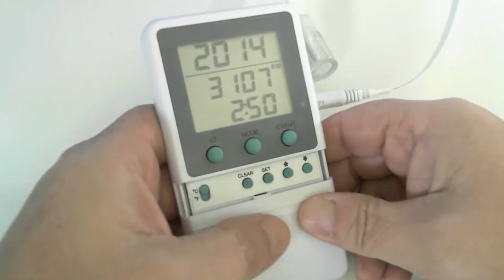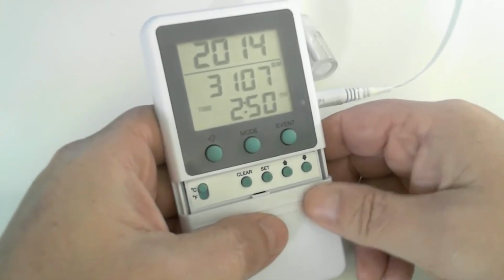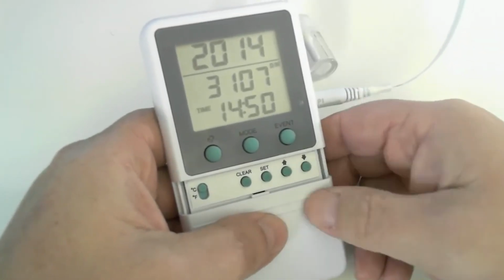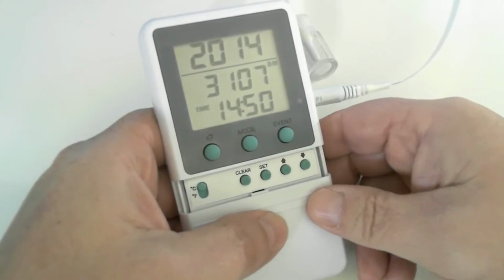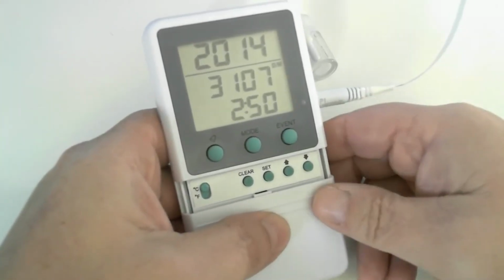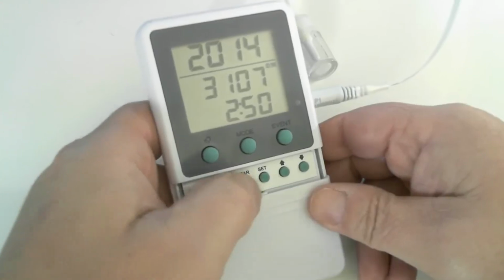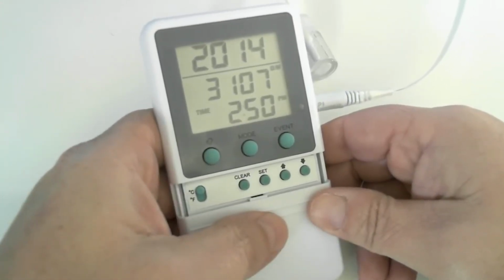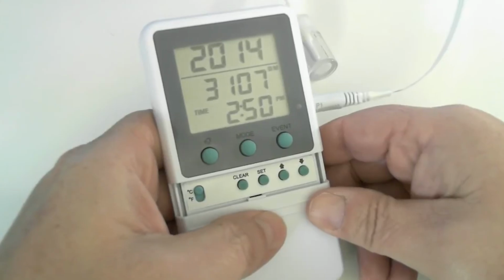Hit the set. And now we have the choice of AM or PM. Currently the PM selected. If you hit the up or down arrow, you will not see the PM. That means you have selected AM. Hit the up or down again, we see the PM. That's what I would like. Let me hit set. And our year, month, day, and time is now set.